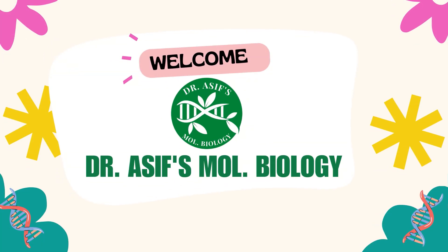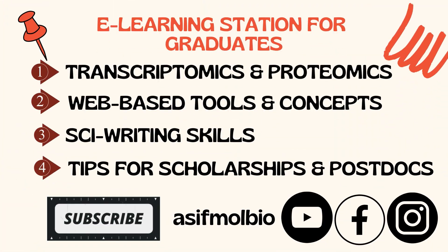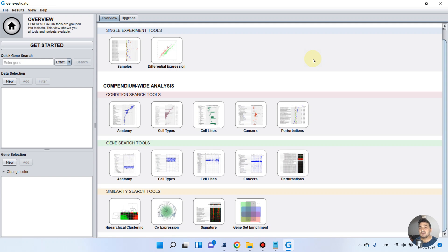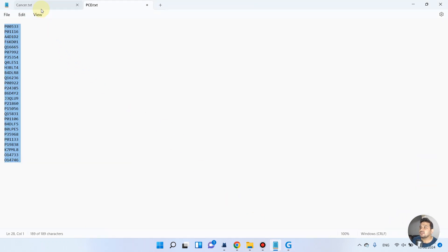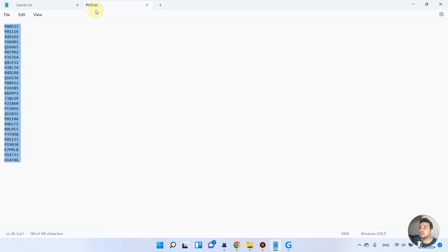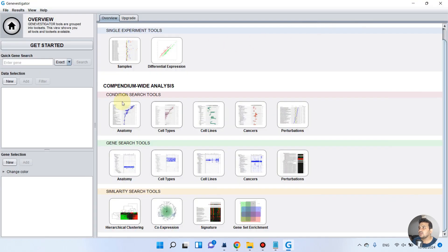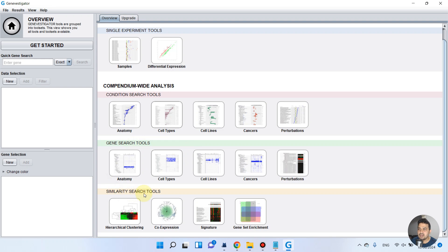Welcome to another video tutorial. In this video I will show you how we can use the Genevestigator tool for Windows to perform a comparison of two datasets. In the first dataset we have a list of genes causing cancer in human beings, and we have a list of genes for programmed cell death in human beings. We will use these two lists in Genevestigator to explore hierarchical clustering and co-expression. We have single experiment tools, compendium-wide analysis, gene search tools, and similarity search tools.